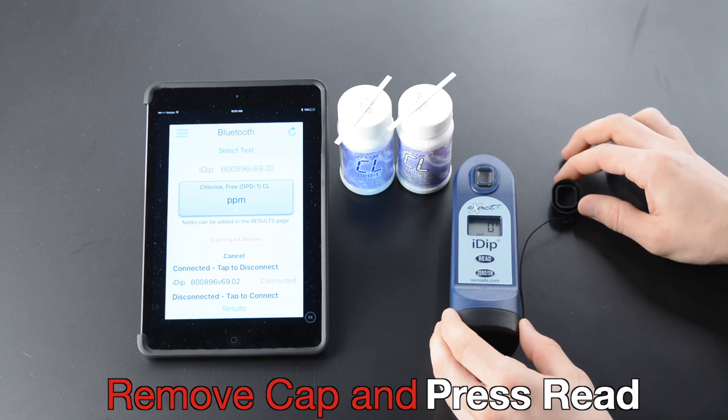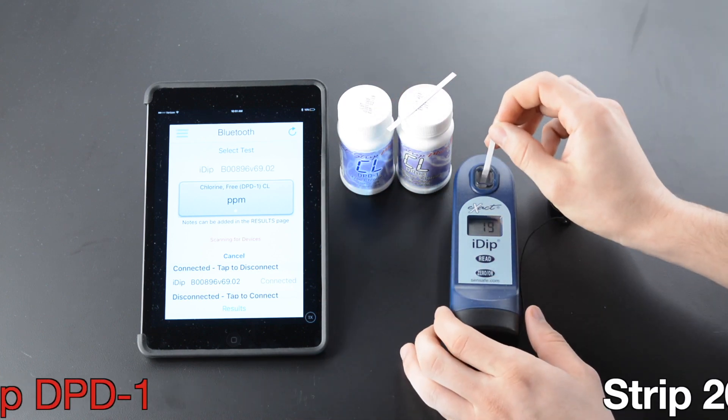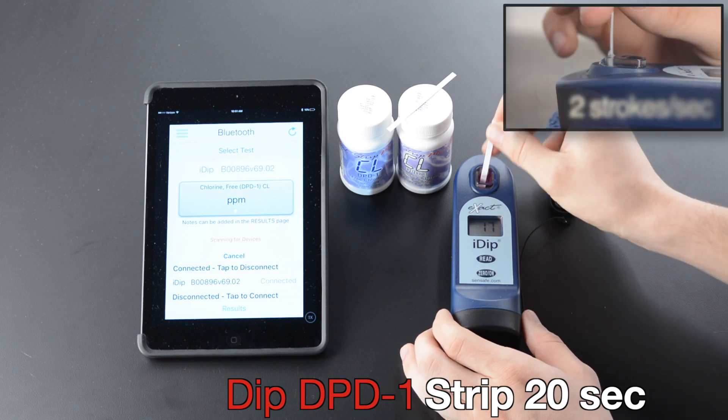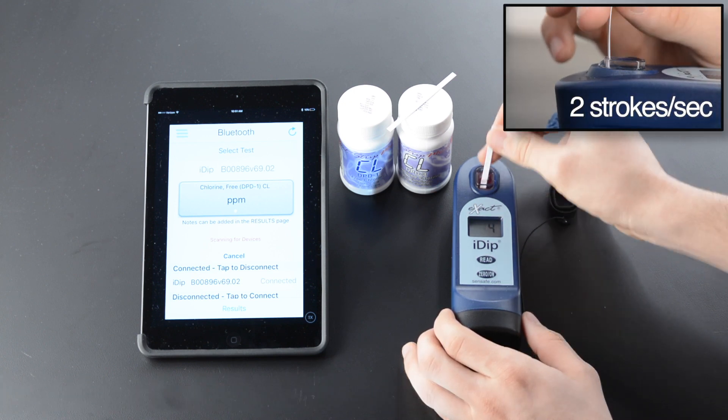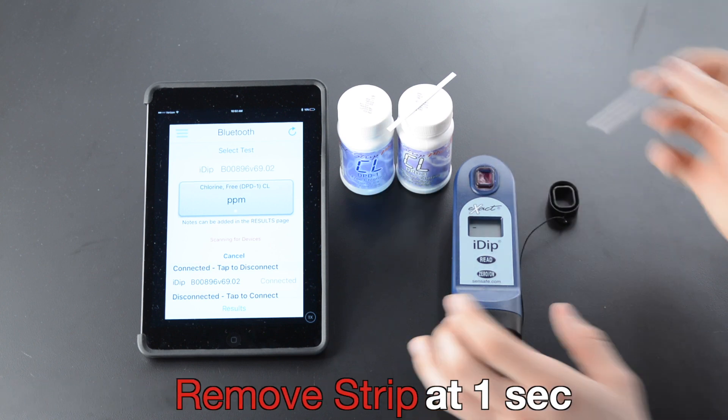Remove cap and press Read. Dip strip. Twenty seconds. Two strokes per second.